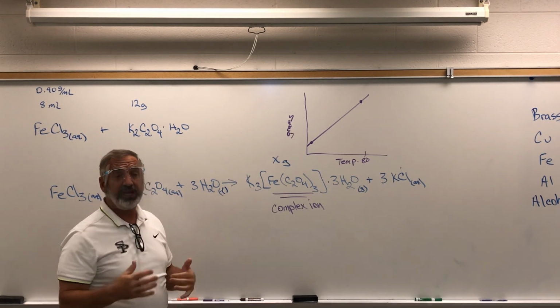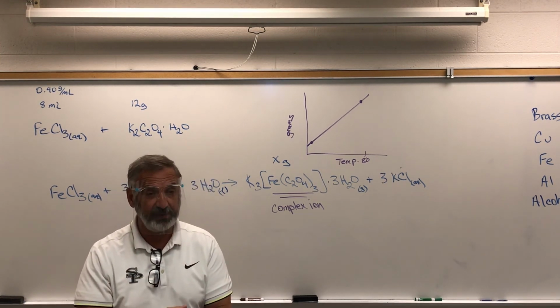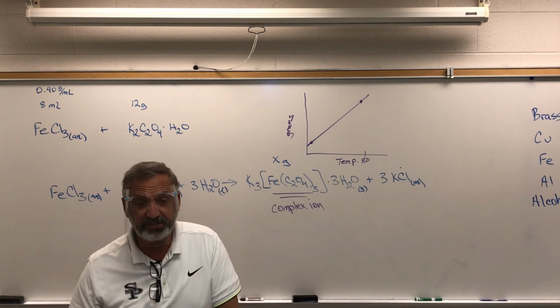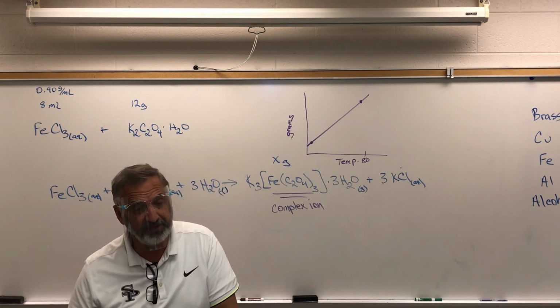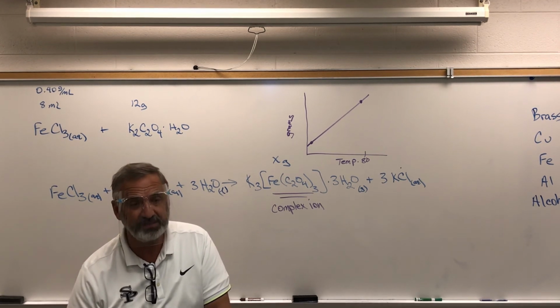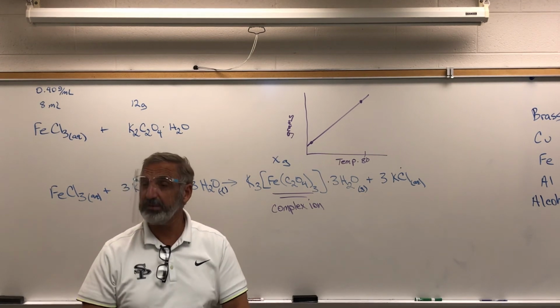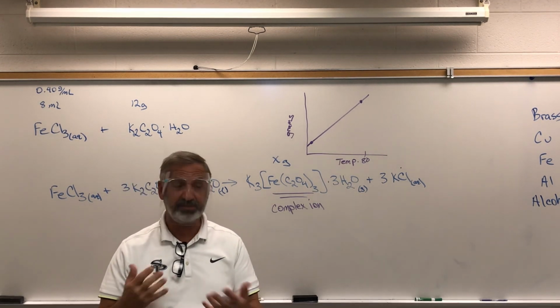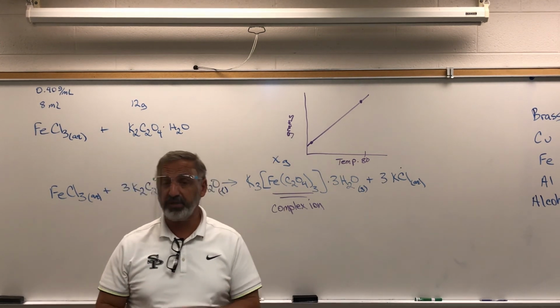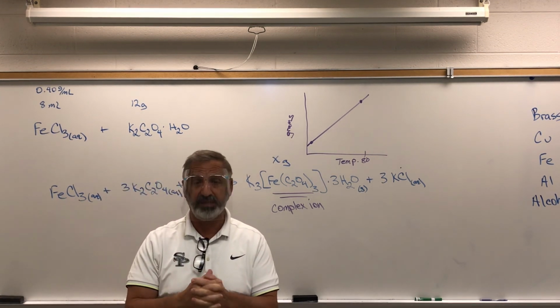Now when we go into the lab, you're going to have 15 minutes when it's just sitting in the ice bath. On the back side of that paper, there's a whole section on recrystallization and how things get purified due to recrystallization. You get to read that during that 15 minutes it's in the ice bath. Okay, and then we'll talk about it. All right, but we're going to try to basically purify it. It's going to be simple. We're going to redissolve our crystals in 15 milliliters of water, heat them up until they dissolve, and then do the exact same thing. All right?